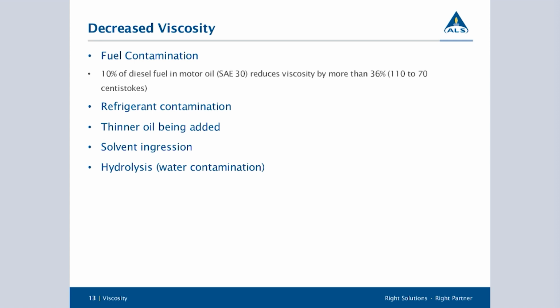So as we learned more about our oil and what it is and how it's related, because all that information is very important to know how it's operating, and to know what your viscosity should be operating at and what it should be coming in within range. As we test it, we start to see that your viscosity can increase, decrease, or be where it's supposed to be.